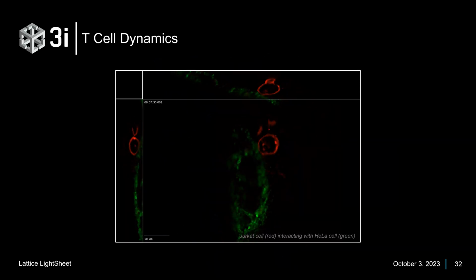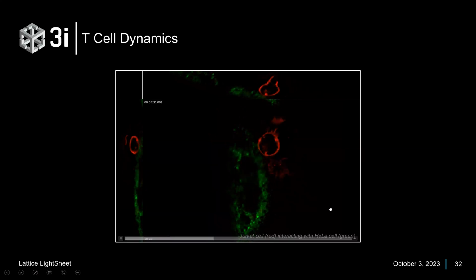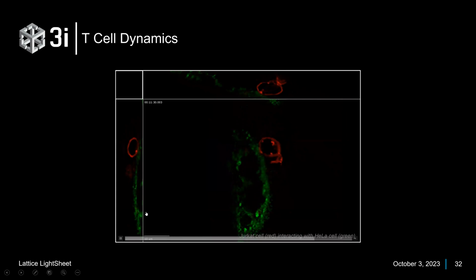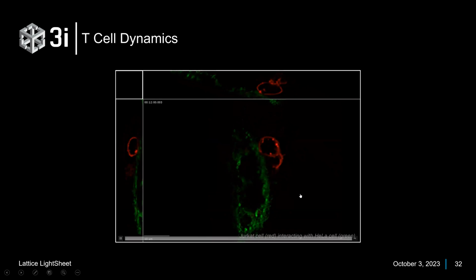I've got to show at least one of these videos of T-cell target cell interactions. This one's displayed a little bit differently than how people would usually see it. We usually get the nice, beautiful renderings of two cells talking to each other. But what's cool about this is I'm showing this in what we call 3-view or slice view. So this is an XZ slice or a YZ slice across the actual sample. So in Z, you can appreciate these two membranes, that high axial resolution I was talking about before, actually interacting with each other. So really wonderful axial resolution, not just lateral. We're looking at these cells interacting with each other.